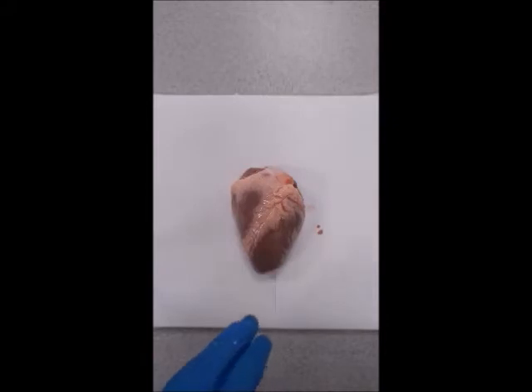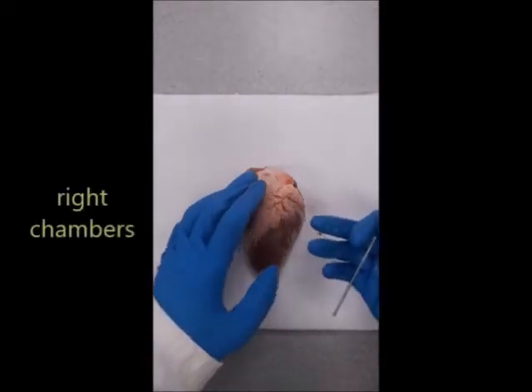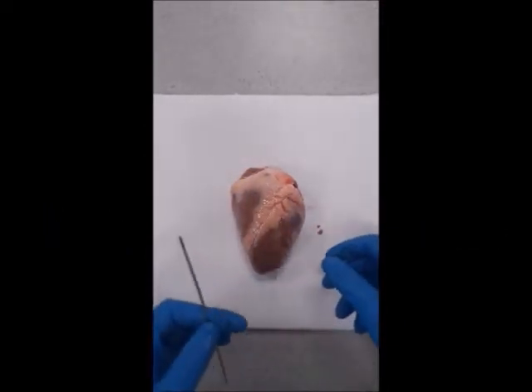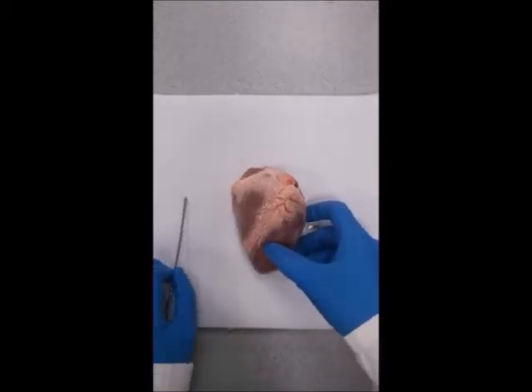Here we have the heart and it's as if the heart is looking back up at us. So the right side is actually on the left and the left side is on the right. You can see that the left-hand side is quite firm — when I squish it, it's quite firm.